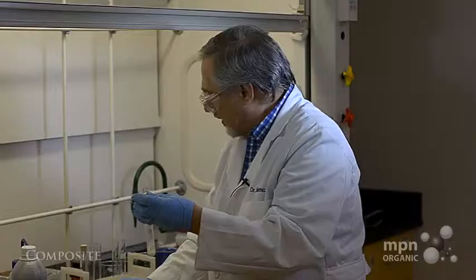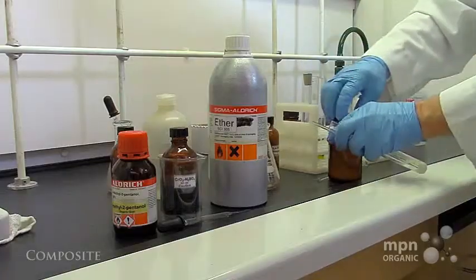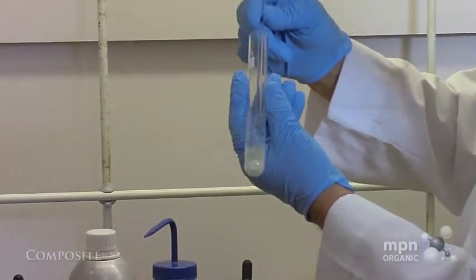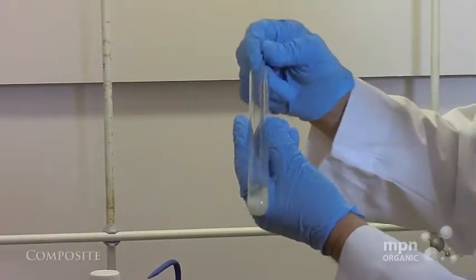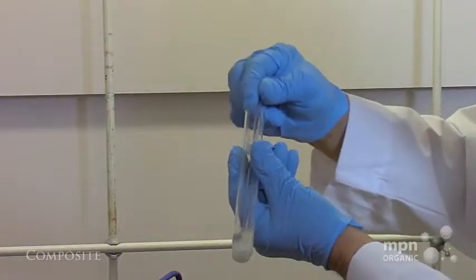Now, you can tell when there is a lot of water in a solution of diethyl ether when the sodium sulfate tends to cake up. Now this doesn't have too much water in it, but it does present a little bit of a stiff drying agent.